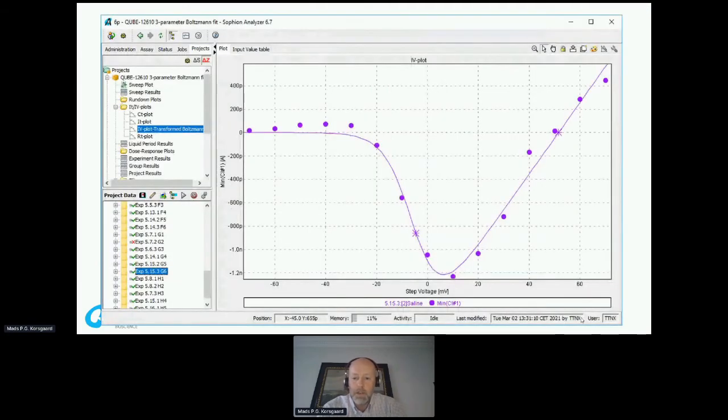So if you look at this typical IV curve and you look at the asterisks, you can probably see that the asterisk on the upstroke or the downward reflecting part of the curve is not geometrically in the middle of the S shape, but that's because it's actually where the conductance starts from increasing to decreasing. So that's a new midpoint you can find on such an activation part of an IV curve.